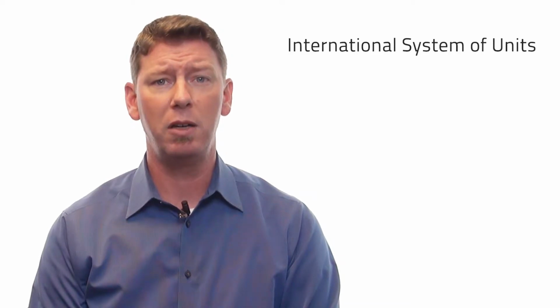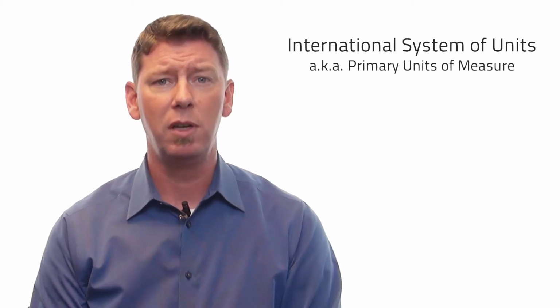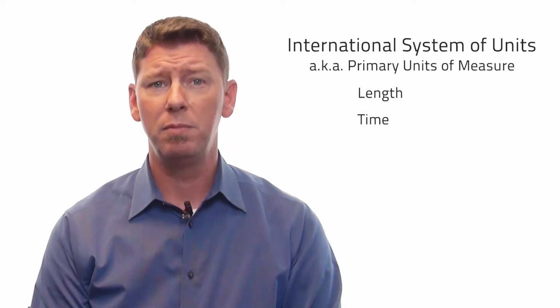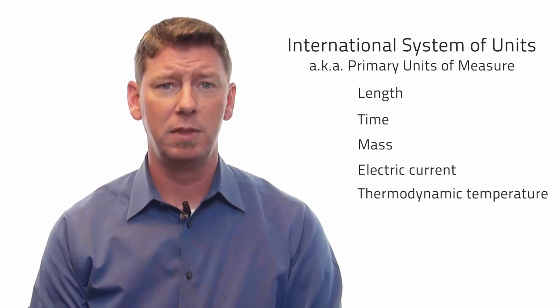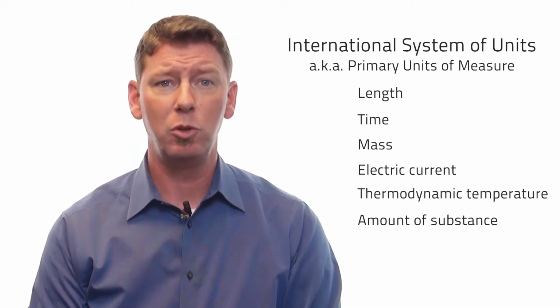The key to understanding gas flow measurement starts with the knowledge of the 7 SI base units that have been quantified and refined worldwide, each of which have exact values that are unlikely to change. These SI base units are also called the primary units of measure and include length, time, mass, electric current, thermodynamic temperature, amount of substance, and luminous intensity.